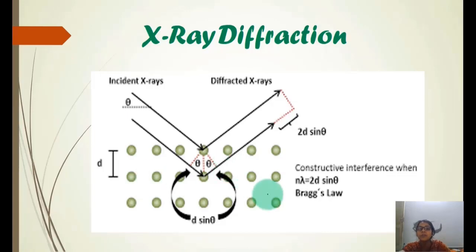In the powder diffraction pattern, basically we use the sample in powder form. That's why it is called powder diffraction. In the powder there will be small granules of the crystal, and each granule will be oriented in some different or random direction. So when X-ray falls over the different granules, they will be oriented in different directions, and you will get different d spacings for the crystal.